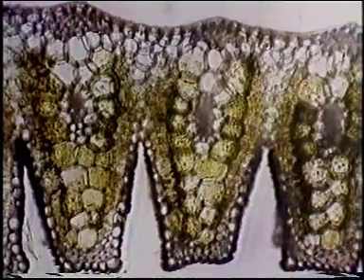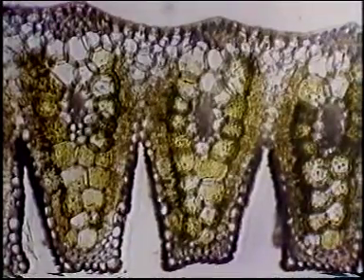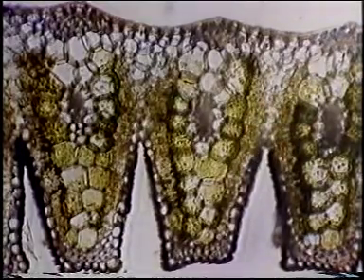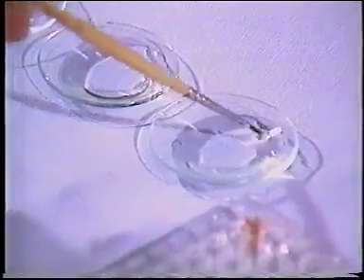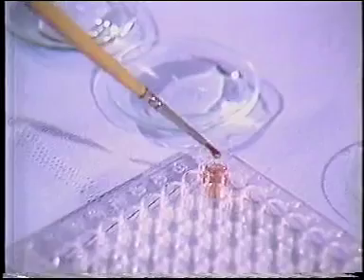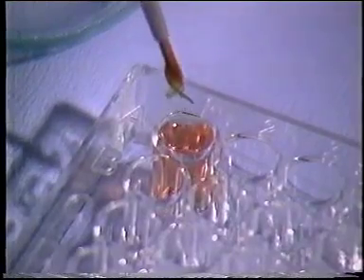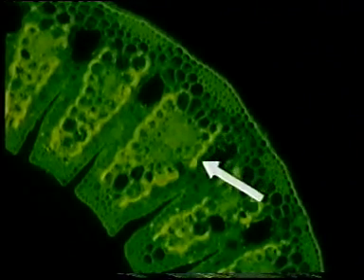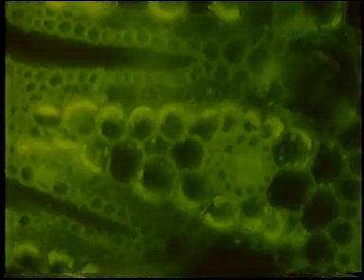Fresh sections of Spartina examined under the microscope showed that there was indeed evidence of Kranz anatomy. In this case, there's only half a ring of cells with dense chloroplasts. Further confirmation was obtained using another technique. Sections of the leaf were put into a solution containing antibodies of the enzyme Rubisco, and then mixed with a fluorescent dye that binds to the antibodies. Under the microscope, the bright yellow-green of the dye shows up only around the bundles. So it's only these cells that contain Rubisco, as you'd expect in a typical C4 plant.